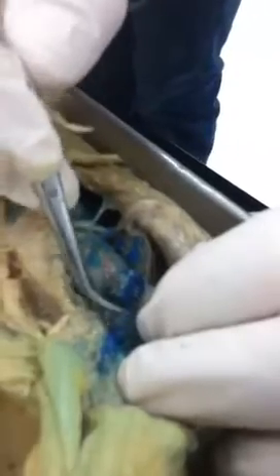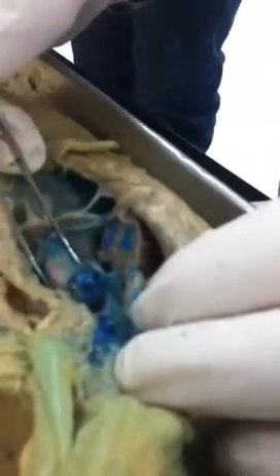And then this is the inferior vena cava coming in here, this big vein underneath, filled with blue. And the superior vena cava up here on top, coming in to the right atrium. Look at that dark blue. Gently you can move that around and see the pulmonary trunk comes out like this, and the aorta is coming out behind it like this, and right where they cross is where that duct that connects them is.